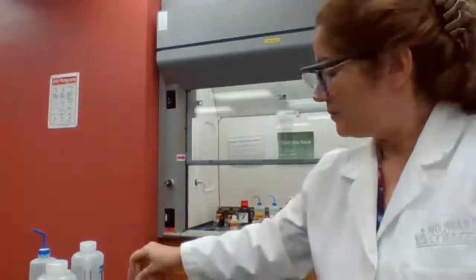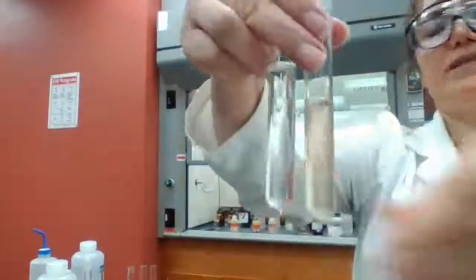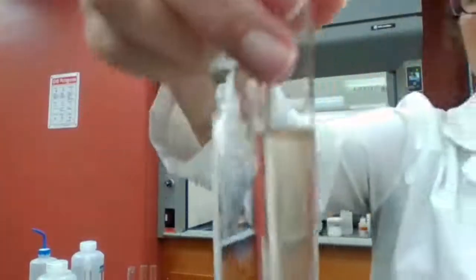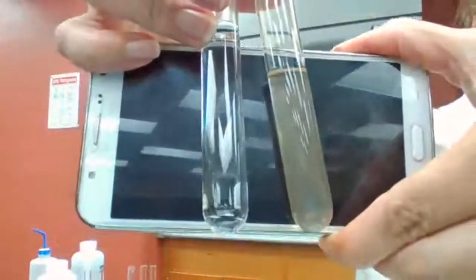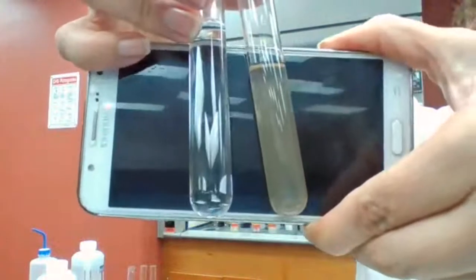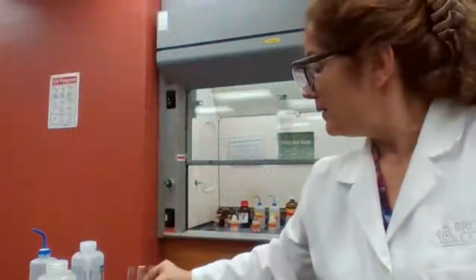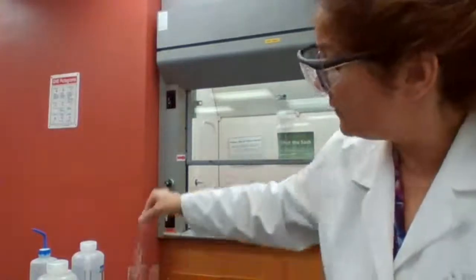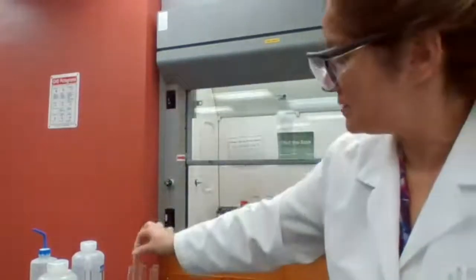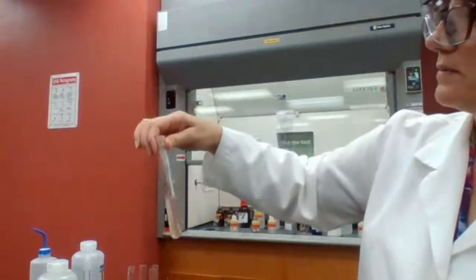I don't know if I like to see it cloudy as a precipitate or is actually cloudy, but you record your own evidence. What do you think it is? Yes, to me, if I'm holding it this way, it looks cloudy. It looks cloudy now.